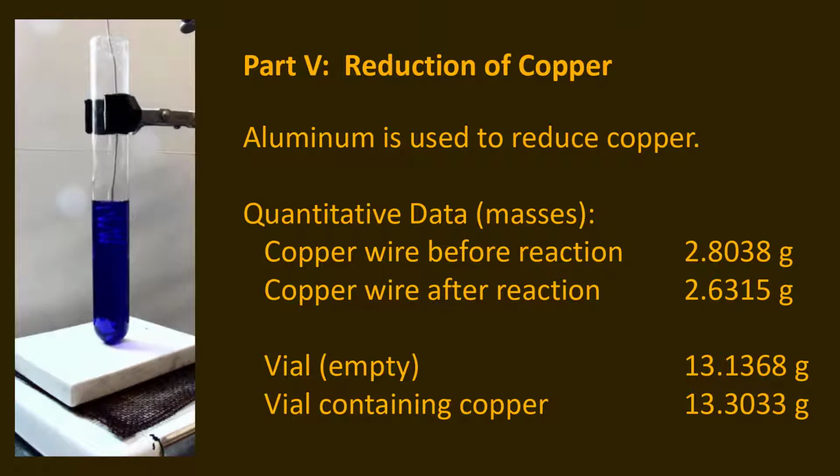and the hydrogen that's generated on the surface serves to sweep the surface clear of ions. Those bubbles will sort of clean the aluminum and blow the aluminum ions that are trying to precipitate out away. And in addition to that, the chloride ions that are part of the hydrochloric acid will transiently stick to the aluminum ions and serve as a sort of ligand that will shepherd the aluminum into solution to somewhere where it's not going to cause us a problem. So again, this is 6 molar hydrochloric acid. It's going to make our solution pretty acidic.